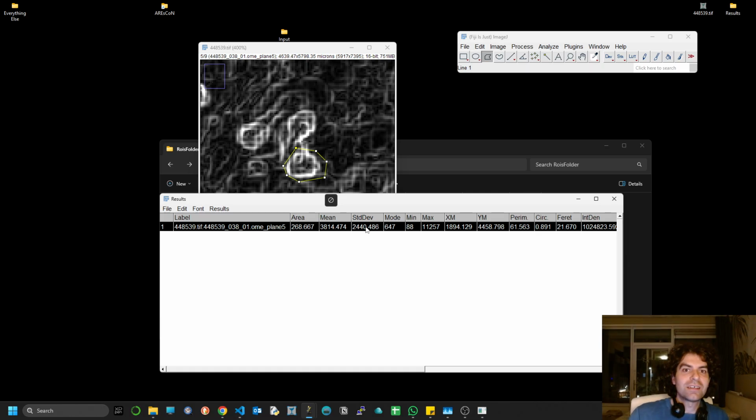And using the find edges is a good way to detect this. So that's what we're going to do.